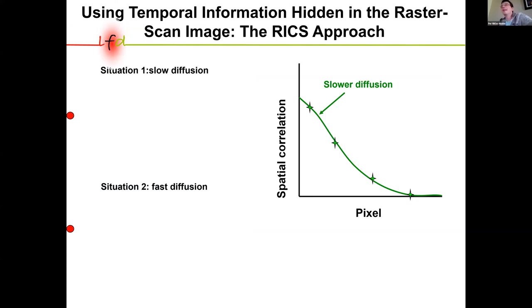Okay, so how can we get some information about the movement of molecules? Well, consider that you start scanning your image. Consider this the red point here on the left corner of the screen. Let me change this to pointer. Okay, here we go. And let's consider we also have a molecule in that spot at the time we start scanning.